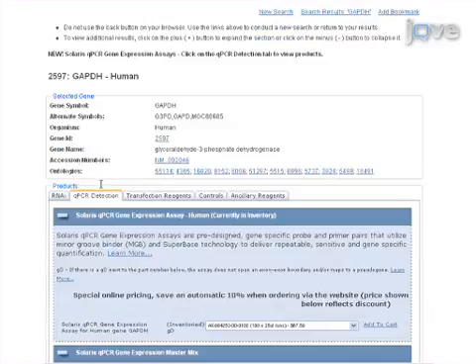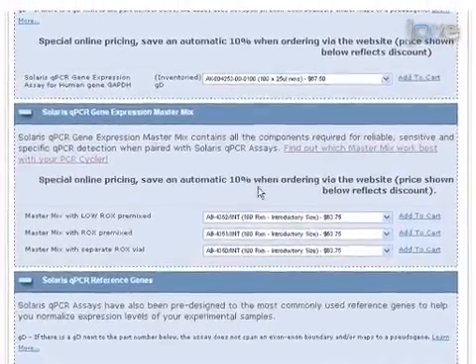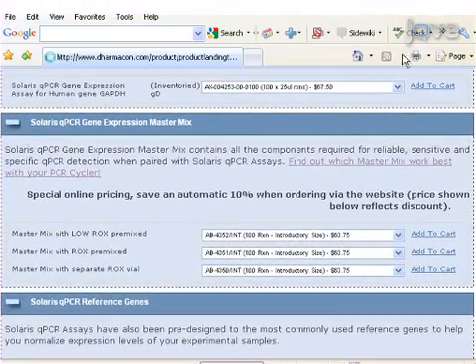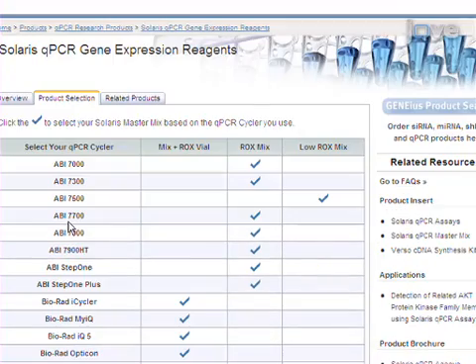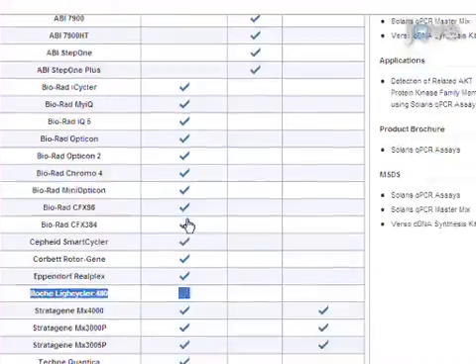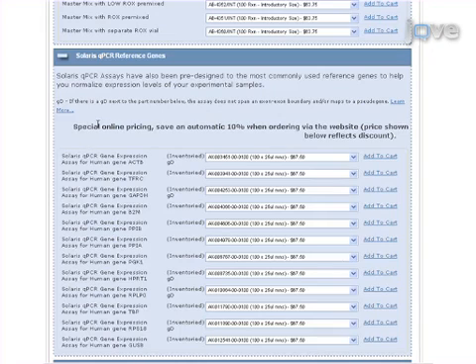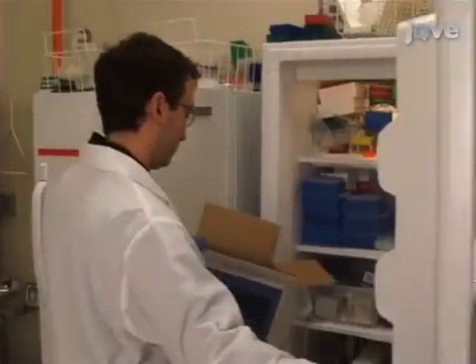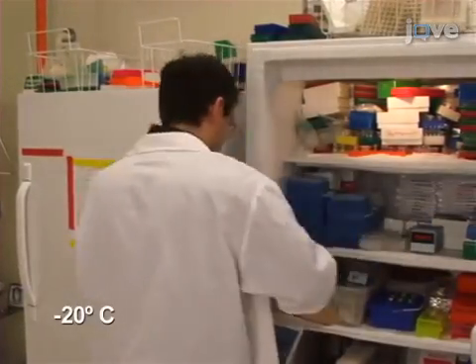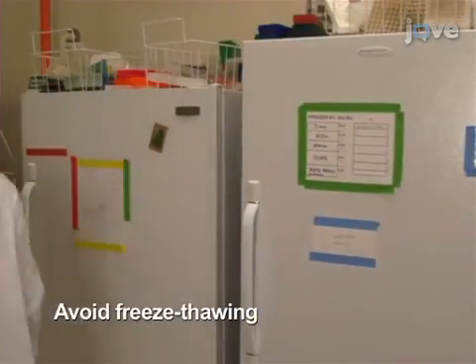Once the primer probe reagent has been identified, find the qPCR cycler that will be used on the menu and identify the compatible master mix — either the master mix with a separate ROX passive reference dye vial, the ROX mix, or the LOROX mix. Here we will be using the Roche LightCycler 480, so the master mix plus ROX vial will be used. It is also important to ensure that an appropriate reference gene is included in the study; here, B2M will be used. Once all Solaris qPCR reagents are received, store them at minus 20 degrees Celsius. The reagents are stable for at least 12 months. Repeated freeze-thawing should be avoided.